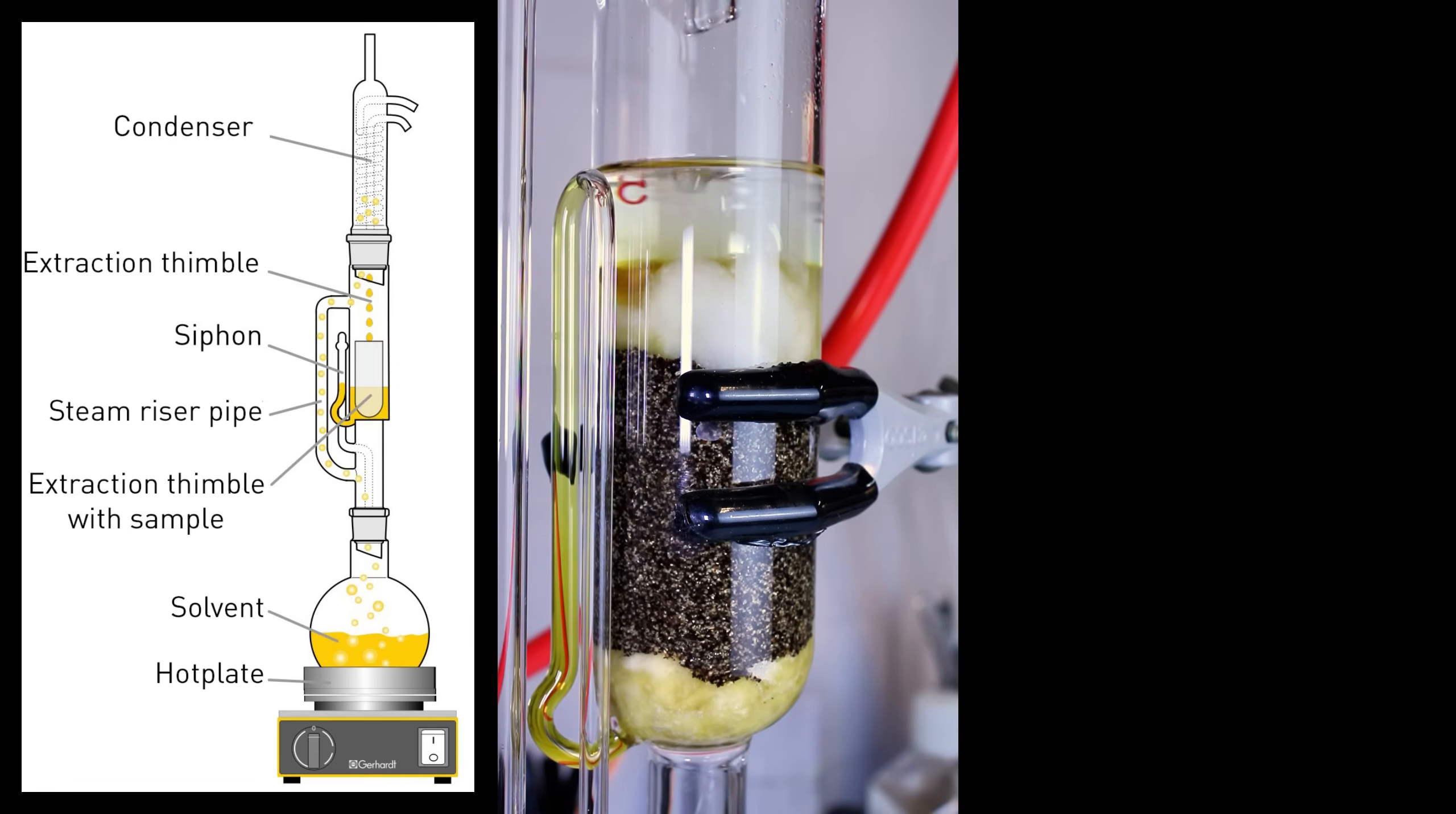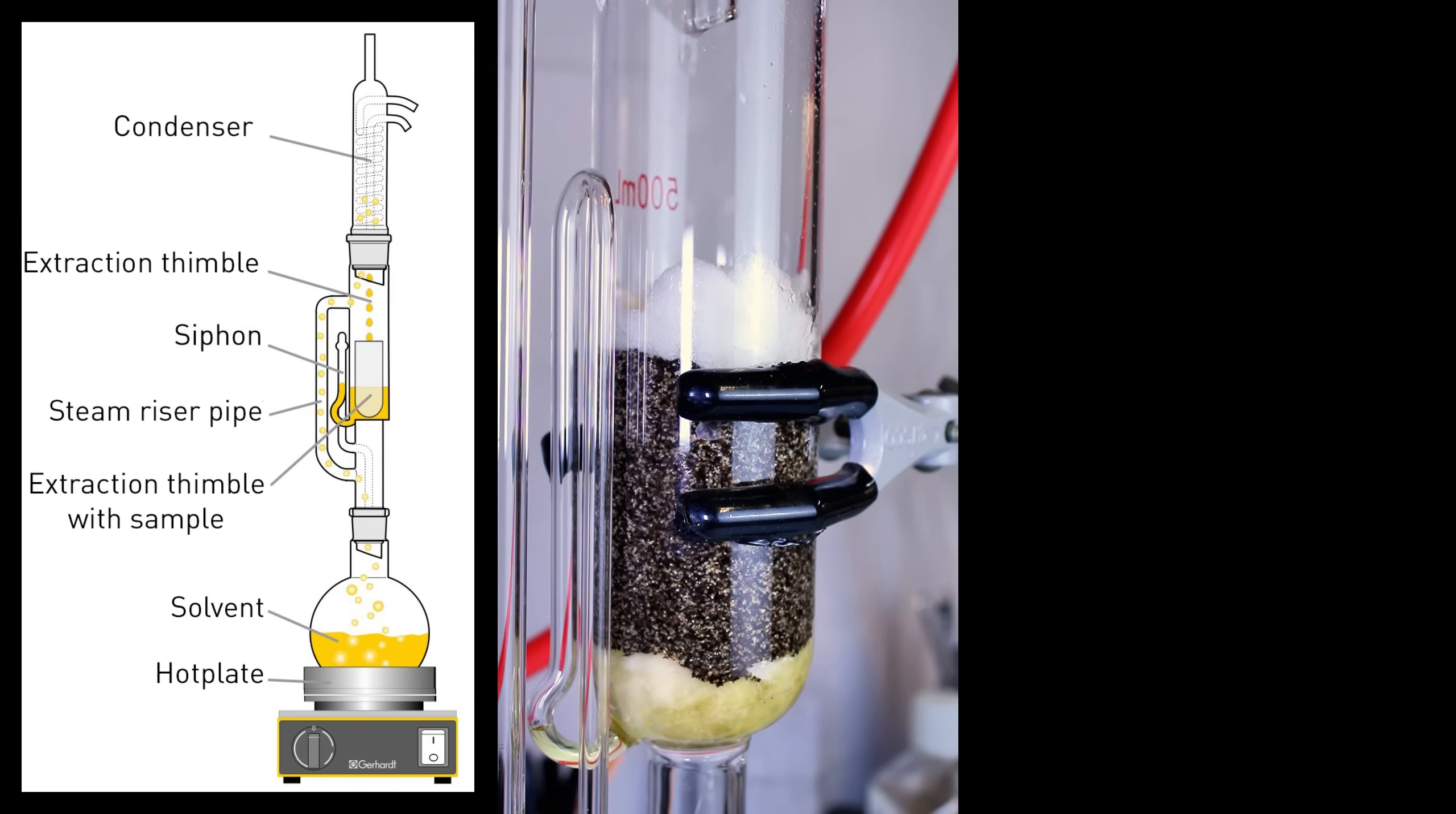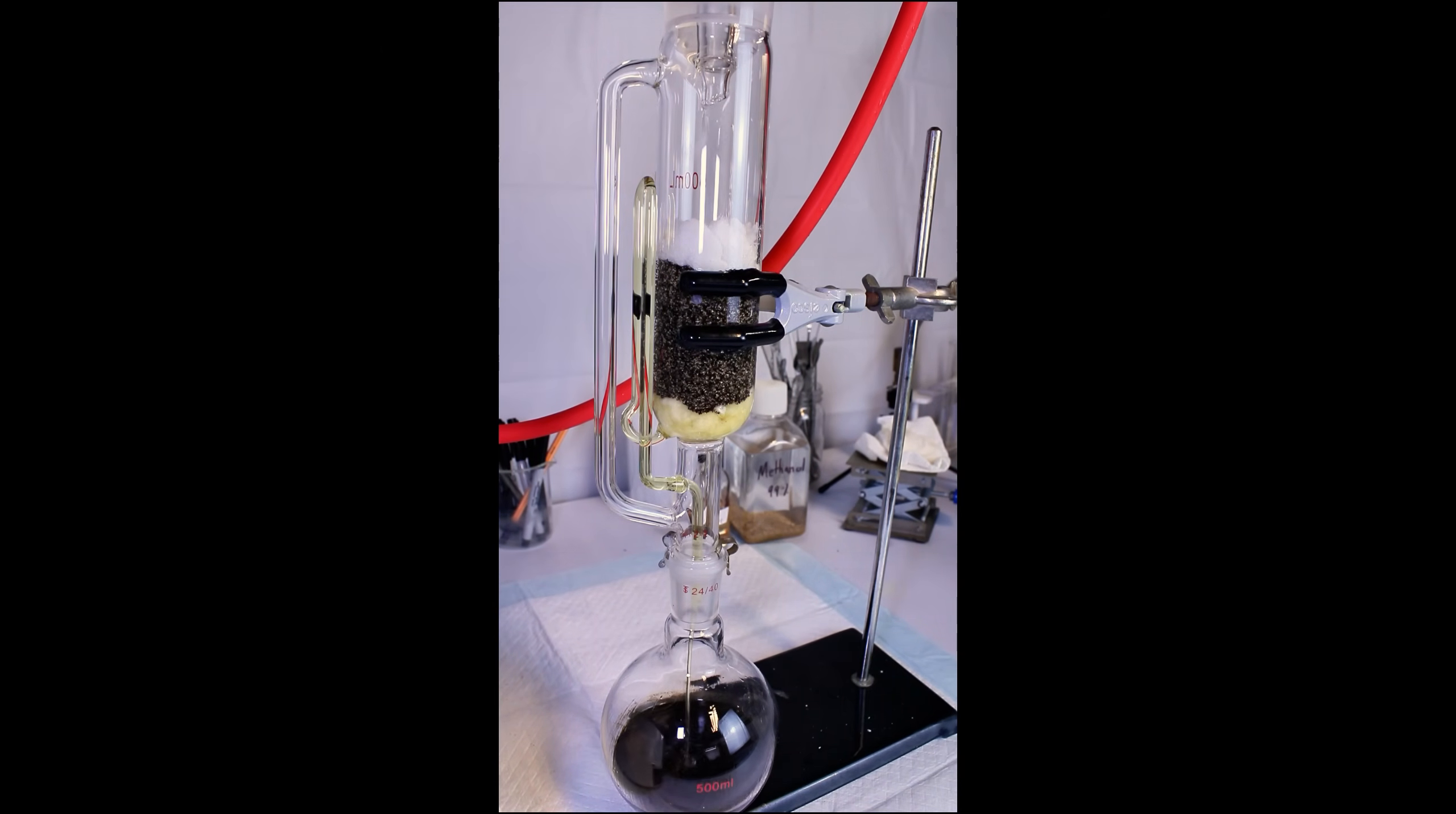Anyway, I go ahead and let this cycle run twice, and then just before the siphon triggers a third time, I remove the heating mantle, allow it to cool, and then trigger a third cycle by dripping a bit of isopropyl through the top of the condenser.